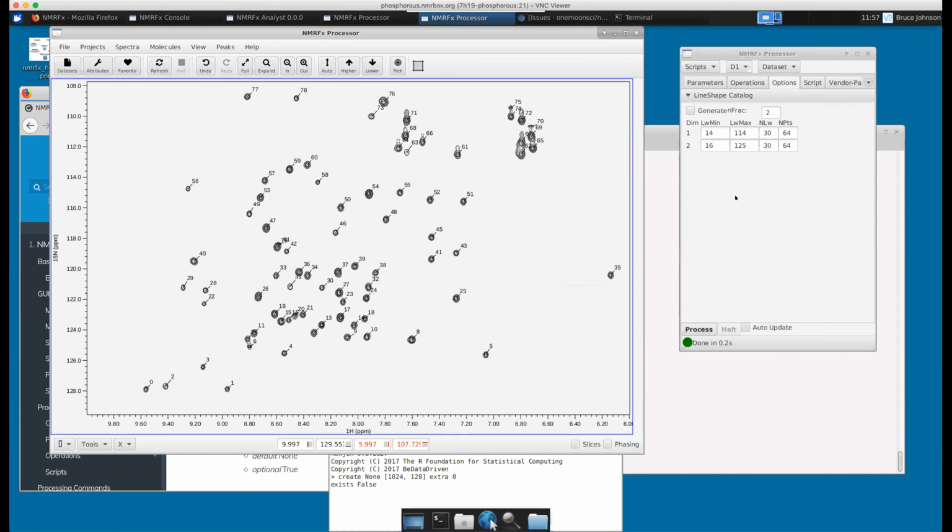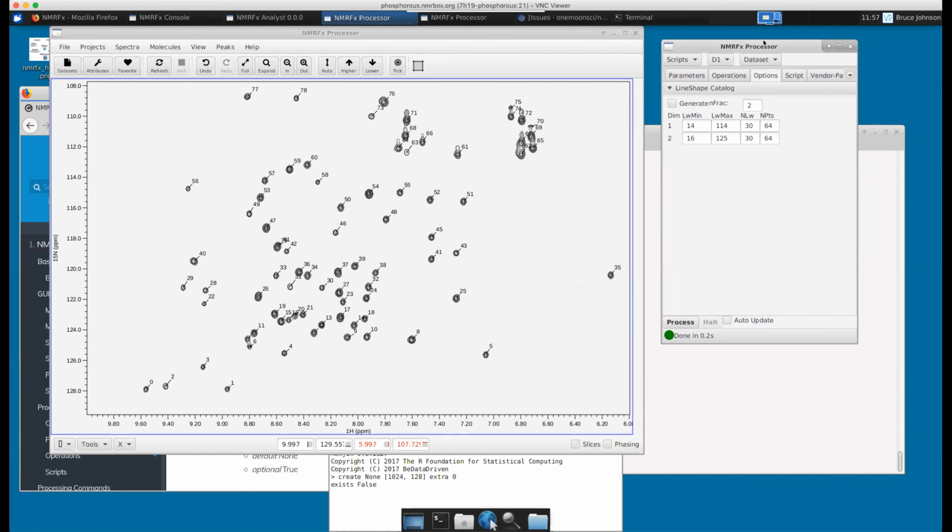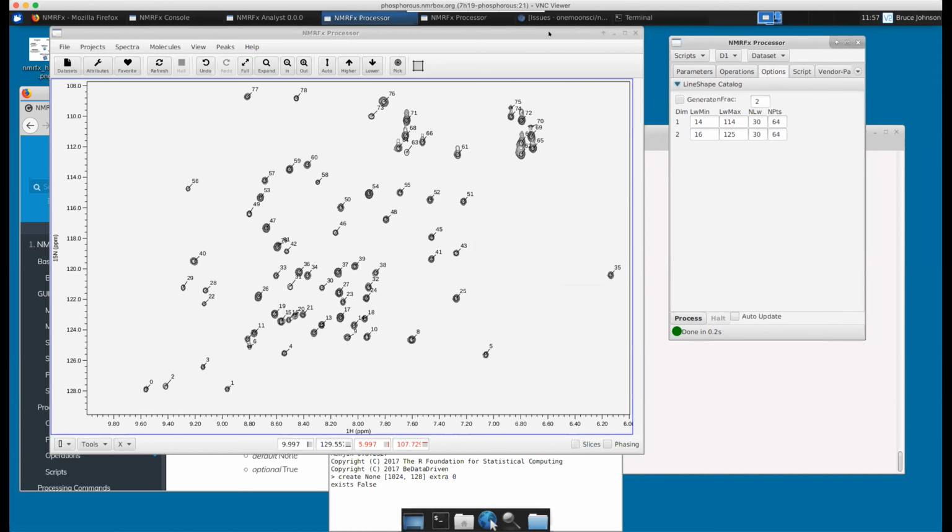And there's actually some new ideas to do things like that. For example, Colin Smith at Wesleyan talked to the ENC about a new method. It's similar to that, it comes up with line shapes in an analytical fashion to fit. So we're doing a lot of work actually playing around with line shape fitting in complex overlap spectra. So I think you'll see more work happen in this area.